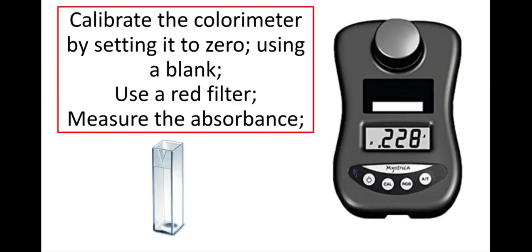What I would then do is I'd use a colorimeter to determine the absorbance of those samples. So this here is a colorimeter and what it does is it passes a beam of light through my sample. Now my samples are placed into a cuvette like this one. So one cuvette per sample, and I place the cuvette inside this part of the colorimeter here, lifting the lid up, putting my sample inside, and reading off the sample absorbance here.